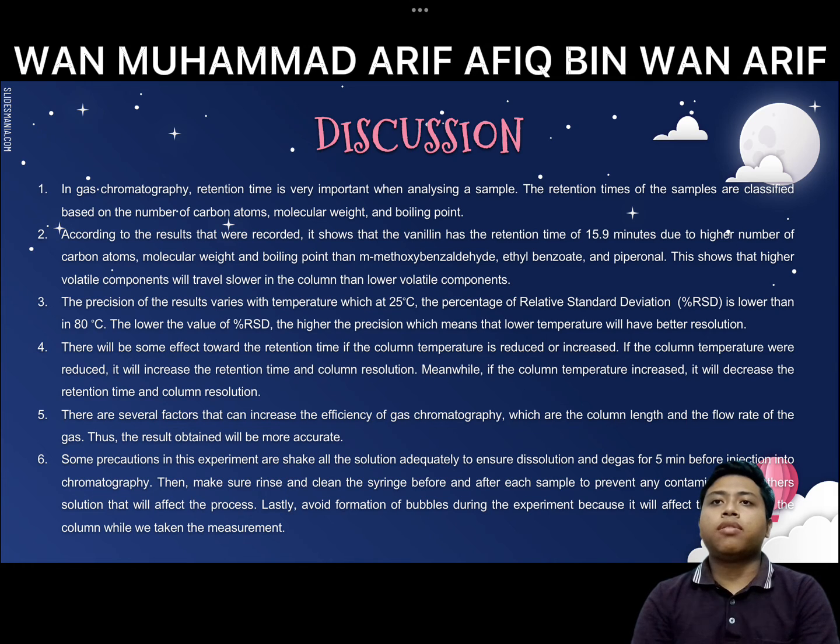There are several factors that can increase the efficiency of gas chromatography, which are the column length and the flow rate of the gas. Thus, the result obtained will become more accurate.